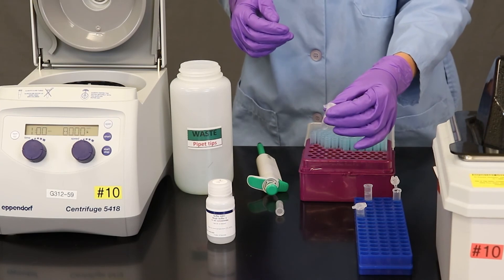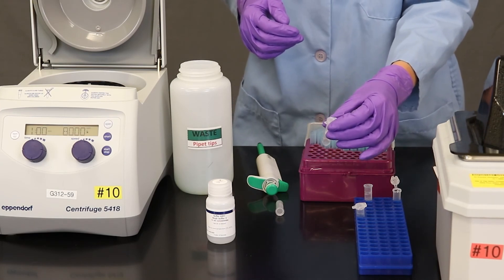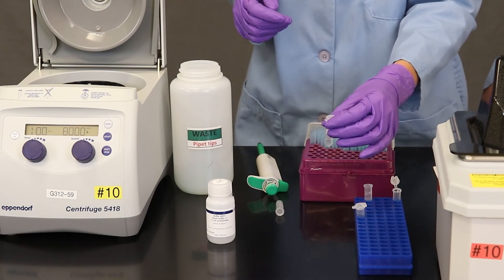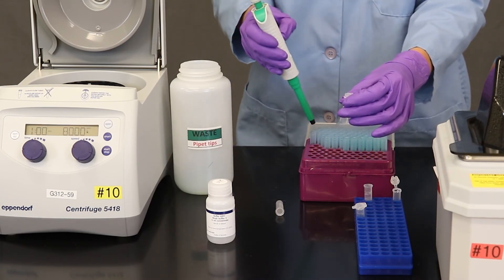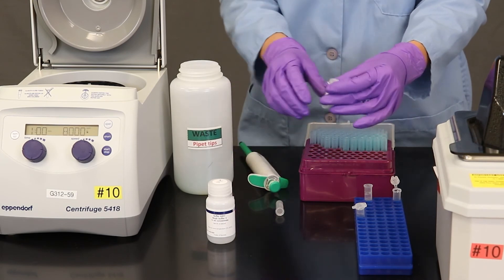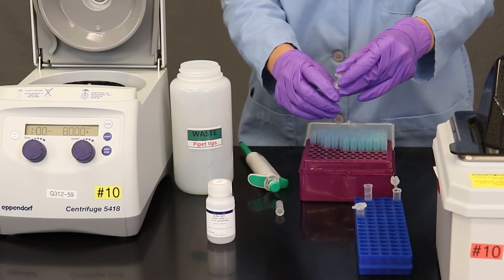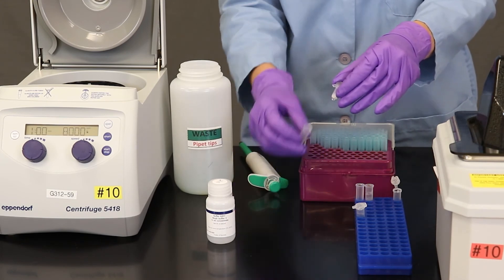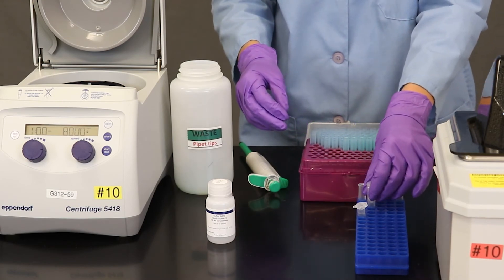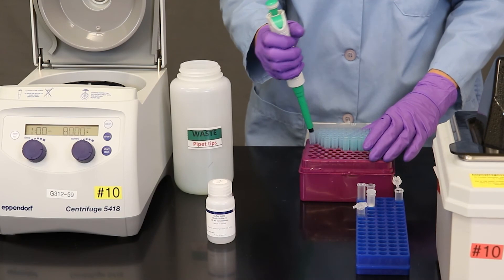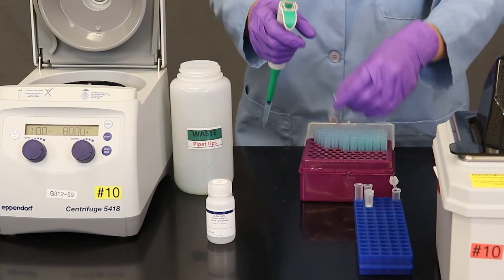So I've removed this tube from the centrifuge following the first wash step. And now I'm going to go ahead and add the second round of wash buffer. So let me go ahead and take off this bottom part of the column first and put on a fresh tube. And then we're going to add this second wash buffer again, 500 microliters of it.